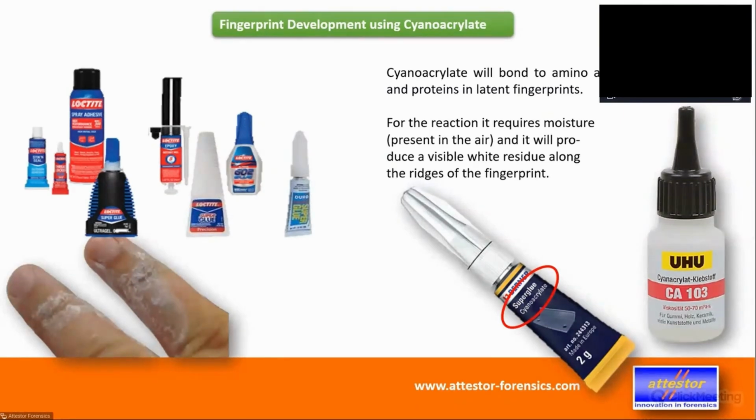So real superglue, Loctite or whatever brand you take, usually has other components in there to make them more liquid, to make them less liquid so they don't drop, to make them sneak into the very, very fine capillary areas, and so on and so on.